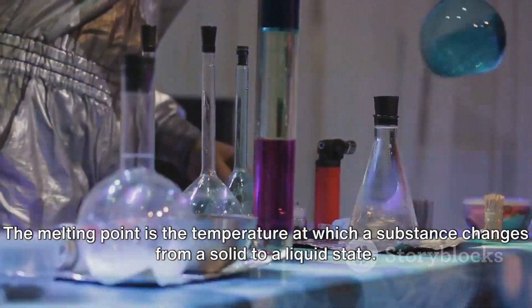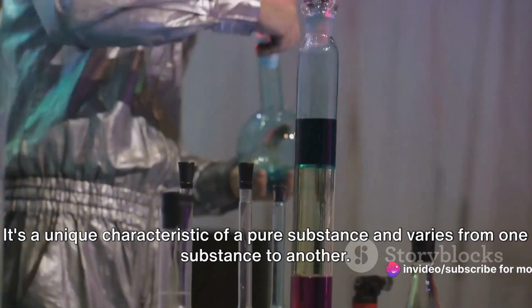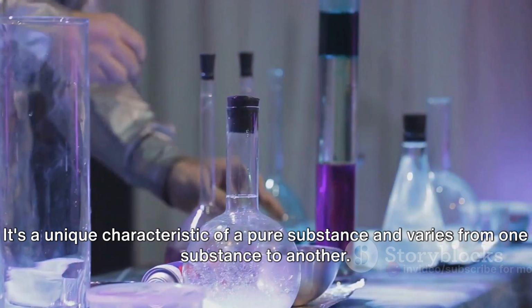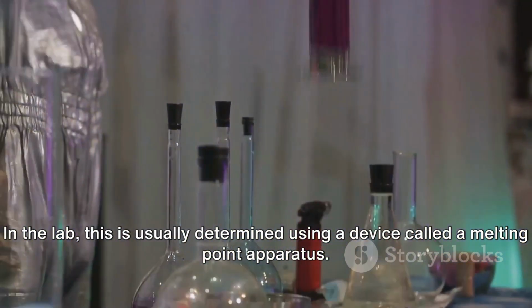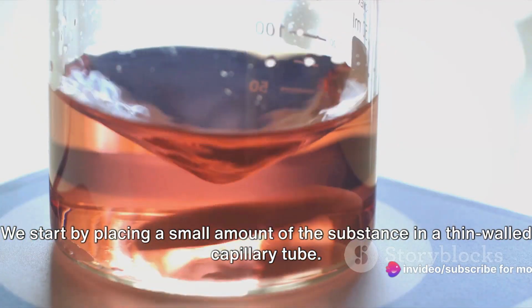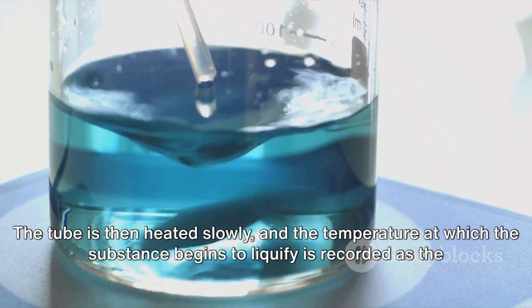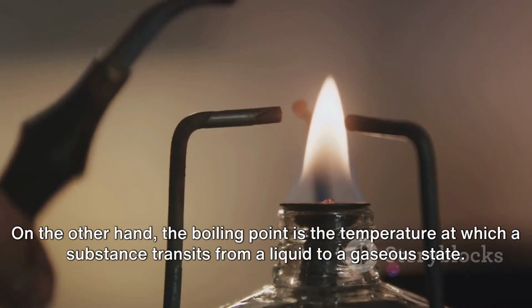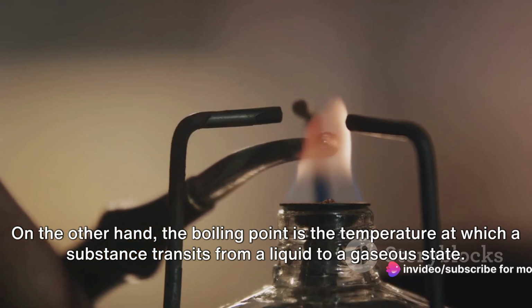The melting point is the temperature at which a substance changes from a solid to a liquid state. It's a unique characteristic of a pure substance and varies from one substance to another. In the lab, this is usually determined using a device called a melting point apparatus. We start by placing a small amount of the substance in a thin-walled capillary tube. The tube is then heated slowly, and the temperature at which the substance begins to liquefy is recorded as the melting point.